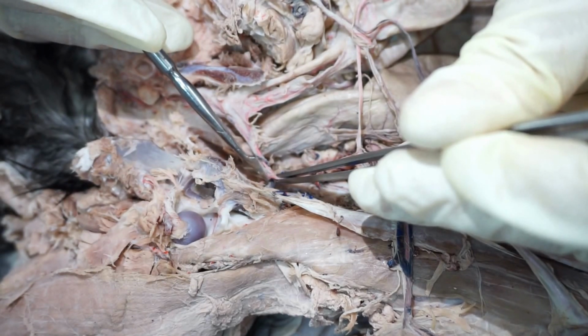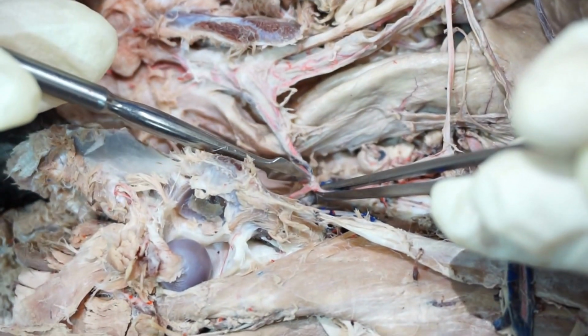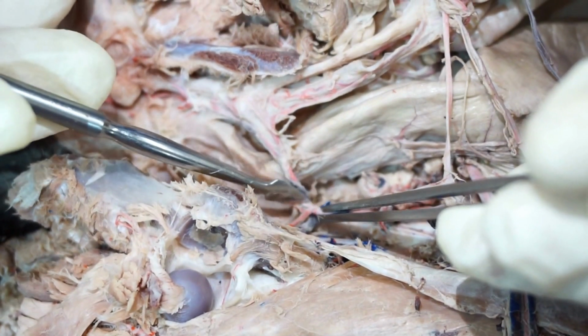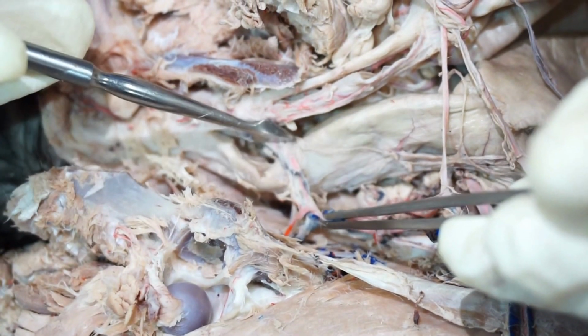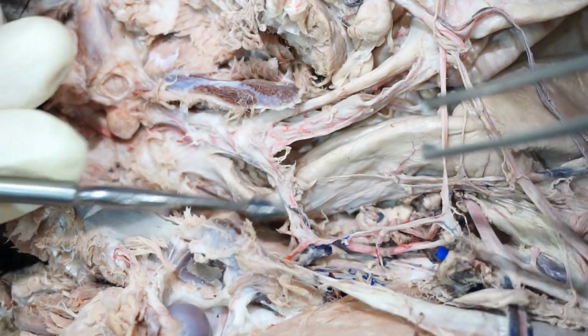The caudal gluteal, once it comes off, then the internal iliac will change names to internal pudendal. So caudal gluteal and internal pudendal.